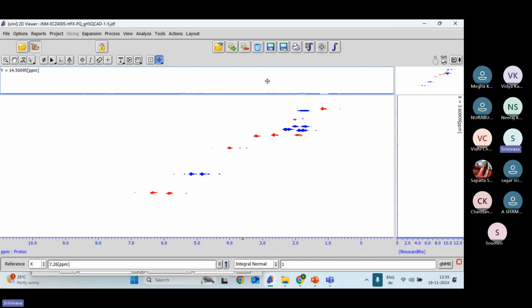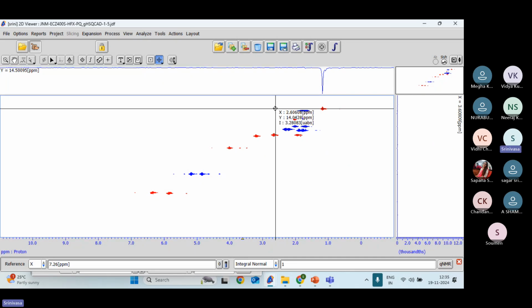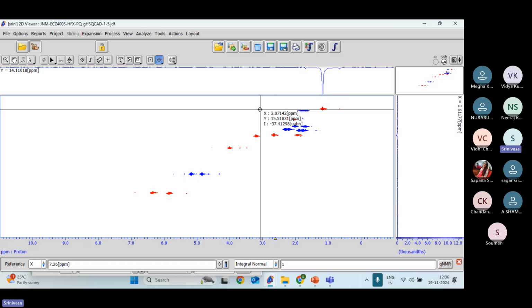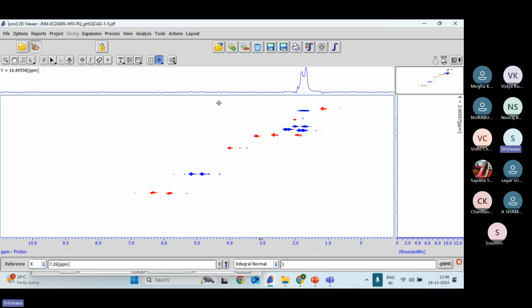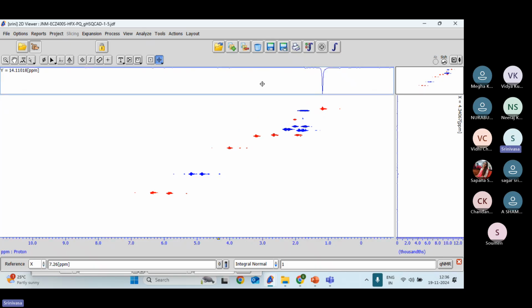Click the home button, select here, click the home button, shows the full spectra. Now here I have taken it. Suppose if I select somewhere here, it shows another spectrum, the spectrum for this line here. Same way. Now phase correction. Let me put the first one. Selected, peak is here. Click on home.